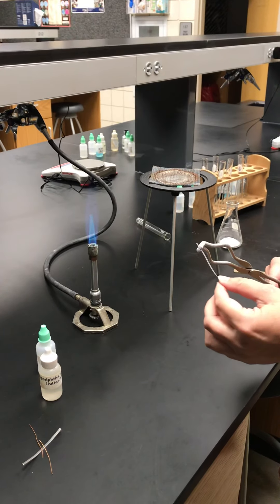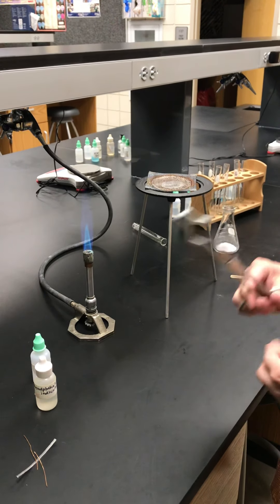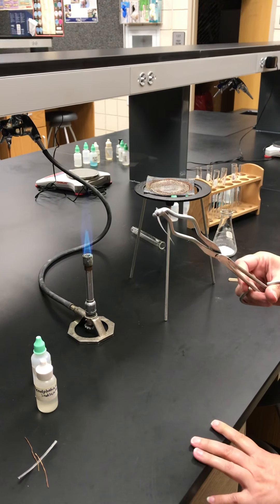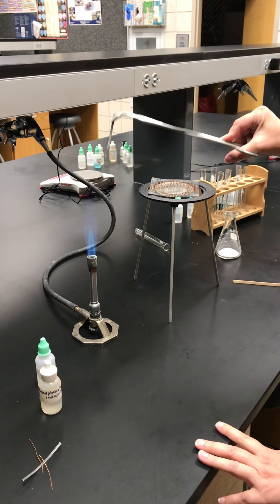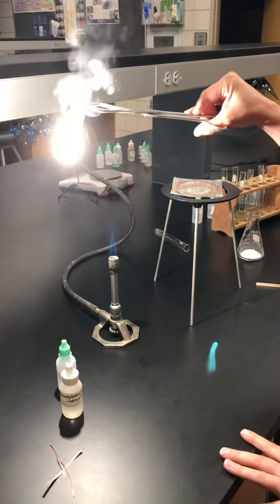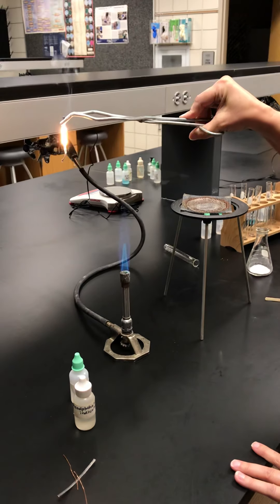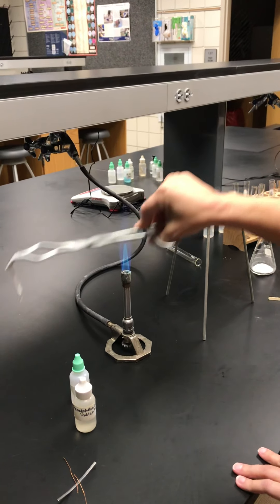This is the chemical reactions lab. The first thing they're going to have you do is take a piece of magnesium ribbon and hold it in the Bunsen burner flame and see what happens. Hopefully you saw that.